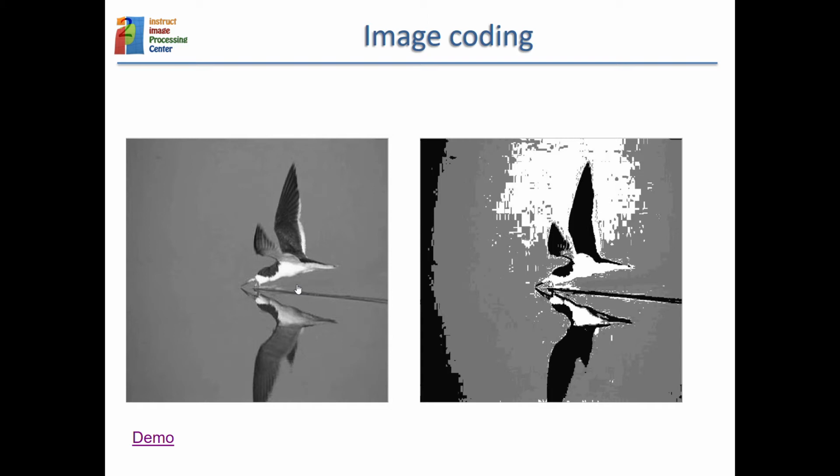So something else is averaging. Averaging is simply dividing by the number of frames you have summed. So summing and averaging is almost the same operation except for the division. If you take 2 frames of 4 bits, you need 5 bits. If you add an extra frame with 4 bits, then you need a 6th bit, and so on.